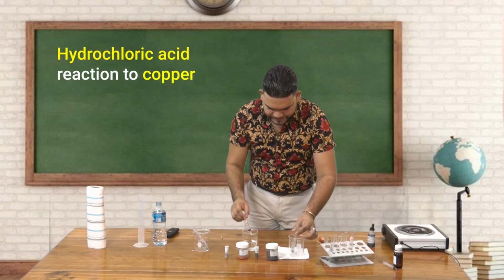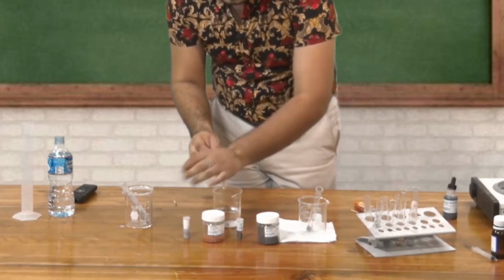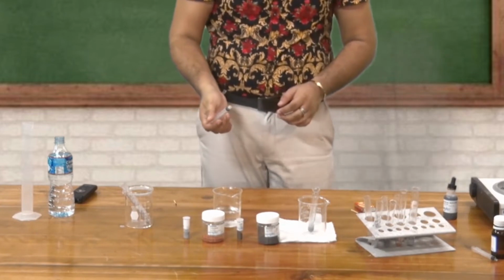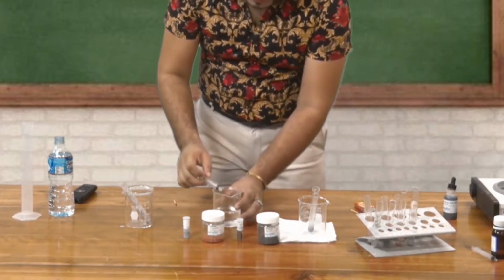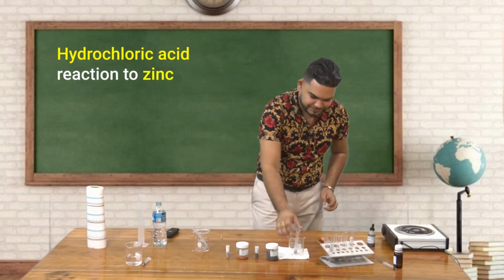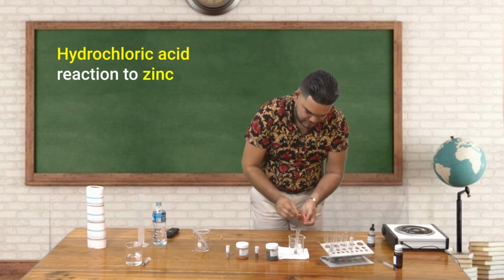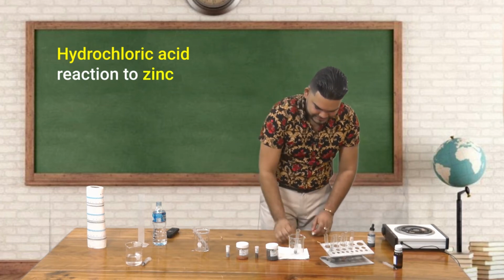And lastly, we have our zinc. So let us go. Boy. We also have another vigorous reaction occurring there. Alright, I'm going to place my hydrochloric acid away. Place my syringe next to it. Let's see if we can have a last popping sound for you. Woo, there we go again. Excellent.